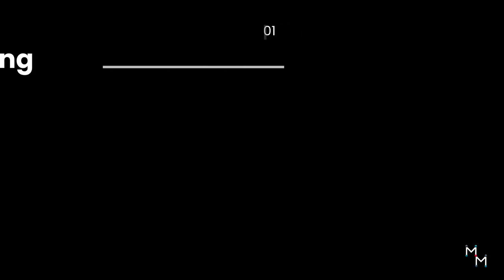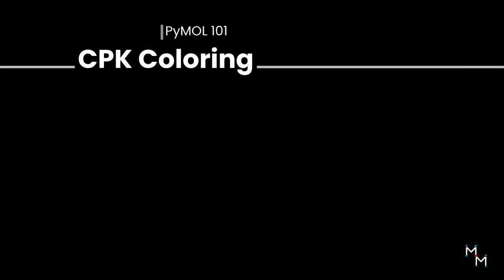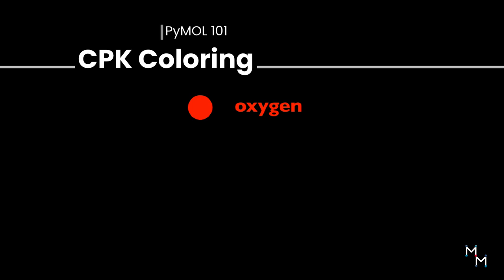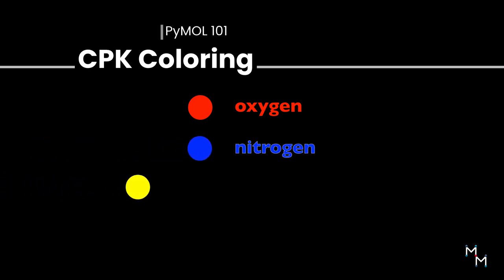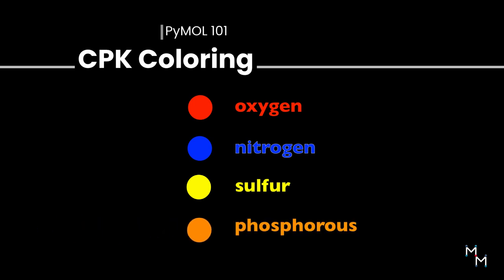By default, PyMOL applies a version of CPK coloring, where oxygen is red, nitrogen is blue, sulfur is yellow, and phosphorus is orange.